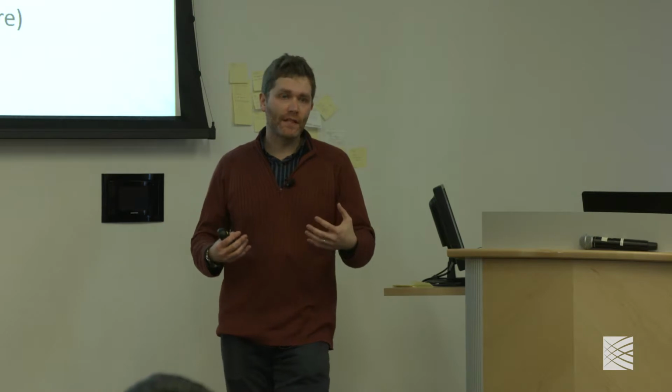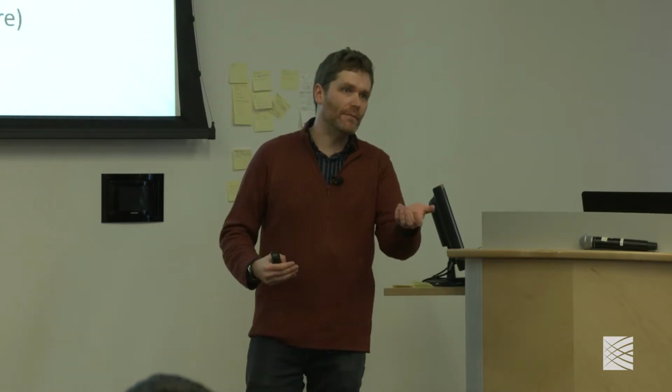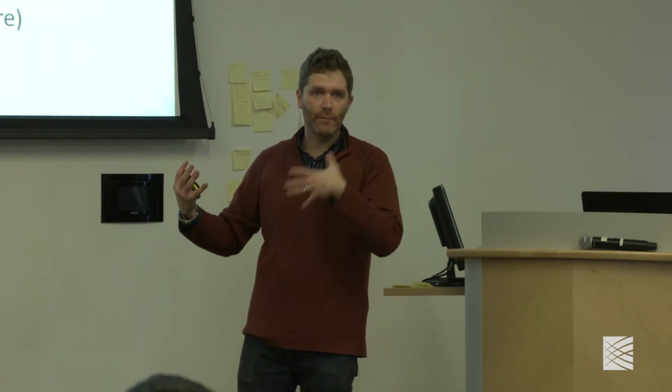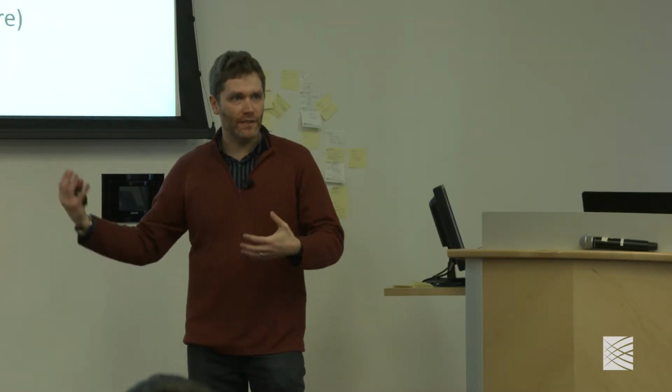You can run without a PON, but you run the risk of getting sequencer errors, because they might not be in the normal but just happen to be in the tumor. Many people also sequence the tumor to a deeper depth, which means you might have a few reads as opposed to zero. So we recommend both, and obviously matching your protocol for how you generated the samples for the case samples and for the normal, maybe with the exception of depth, since we can deal with differential depth in these tools.